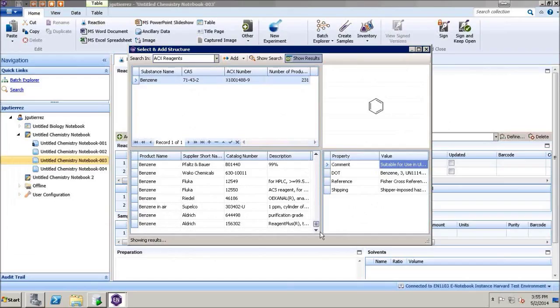Okay. Any questions? Nope. I've been trying the search function here, and I have hit a couple of errors, but I'll send those screenshots along. All right. That would be great for us to have. I'm working to have this available for you very soon. Okay.